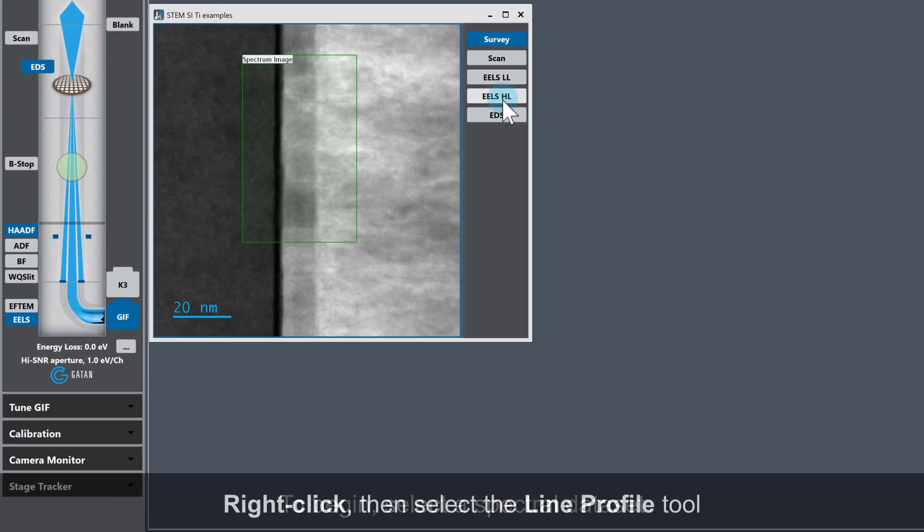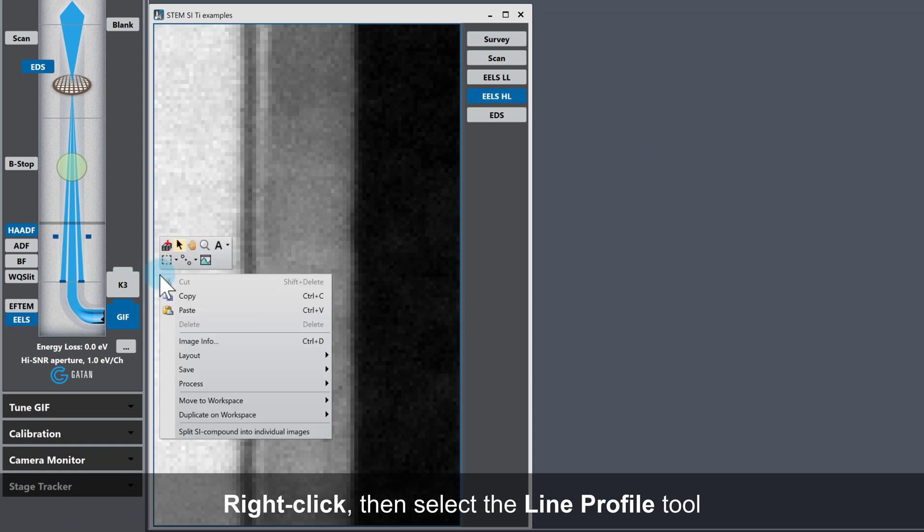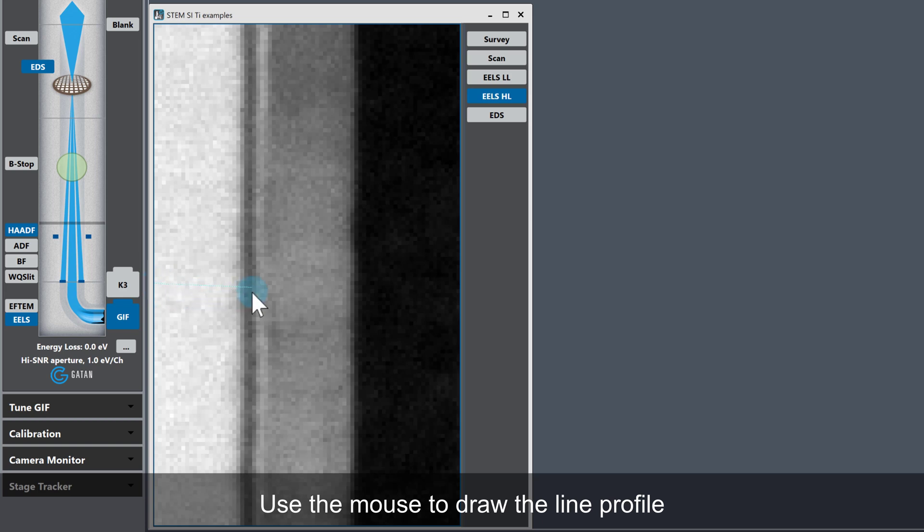To draw a line profile, right click and select the line profile tool from the floating menu. Then left click and drag where you want your line profile.